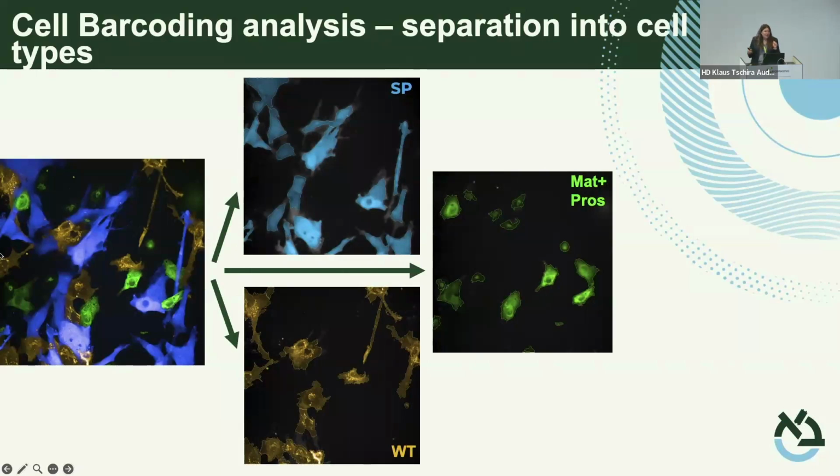I just forgot to mention before, we used only 3 channels because we want to leave 1 channel free for any other analysis that we want to do downstream, such as viability, toxicity. We want to stain for the renin, for the mutant localization. Okay, so we just need to use 3 colors.